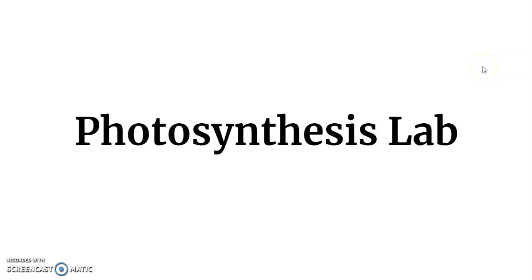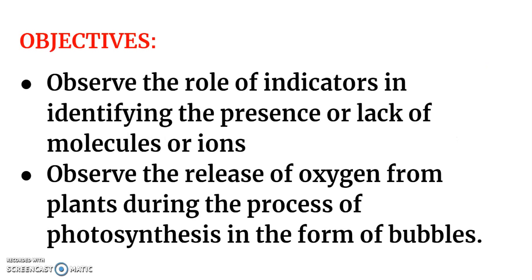Good morning. Today you will be completing a lab about photosynthesis. In this lab, you should be able to observe the role of indicators in identifying the presence or lack of molecules or ions. You should also be able to observe the release of oxygen from plants during the process of photosynthesis in the form of bubbles.